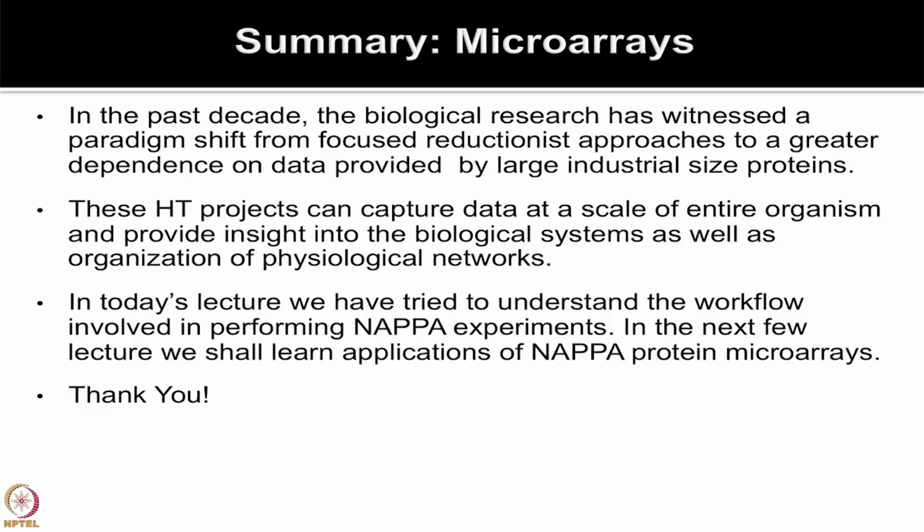So, in the past decade, biological research has witnessed a paradigm shift from the focused reductionist approach to a greater dependence on the data provided by large industrial size projects. These high throughput projects can capture data at the scale of an entire organism and provide insight into the biological system as well as the organization of physiological networks. I hope in today's lecture I was able to explain how best you can do protein microarrays.